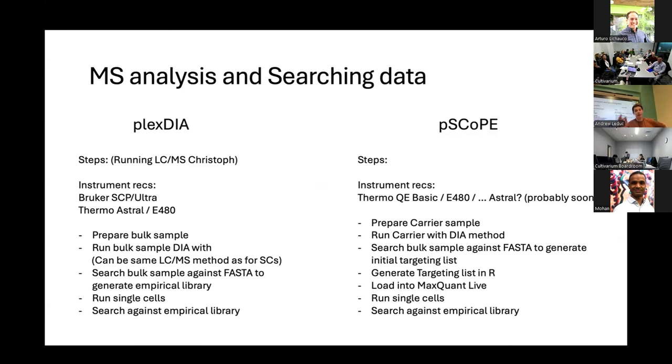So that's great. Generally the identifications are a bit lower and the data is a bit noisier because you deal with interferences. You try to isolate one peptide at a time, but you don't always succeed, because the resolution of the quadrupole, which is what you're using to isolate one thing at a time, is not that high. So other things get in with it, and these contribute reporter ions that add a little bit of noise, called co-isolation.